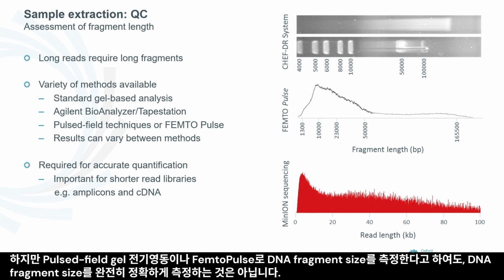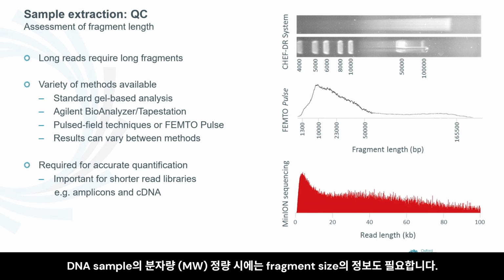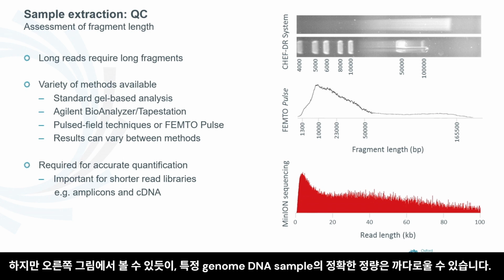Though these two methods are considered state-of-the-art, they don't guarantee concordance. We took some E. coli DNA and checked the fragment length using both methods and observed quite different fragment length distributions, although both methods indicate the presence of long fragments, which we observed in the downstream sequencing. Molar quantification of the sample requires knowledge of the size of the material too. However, as the figures show, accurate quantification of certain genomic DNA samples can be tricky.